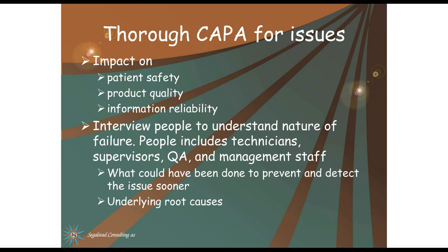For example, the instrument failed to give the correct results, and I'm not talking about that the results were out of spec or something, but about other problems like the blind did not meet the expected result. Root cause was found to be that no system suitability test was run or something was not calibrated. How do we make sure that this does not happen another time? Or said differently, what preventive actions can be made? We include the missing part in an SOP or inside the method or whatever is appropriate. Needless to say, document the whole error and actions, CAPA.